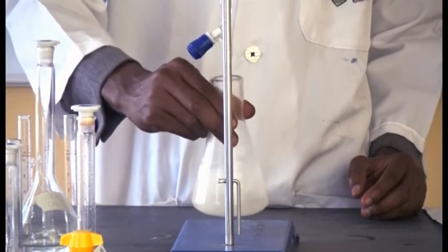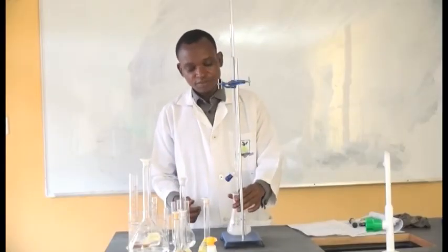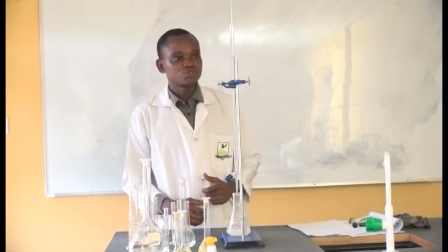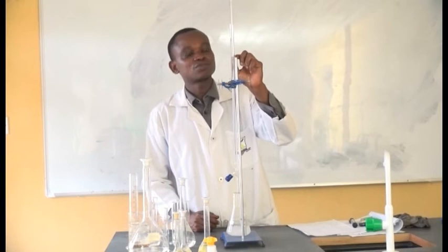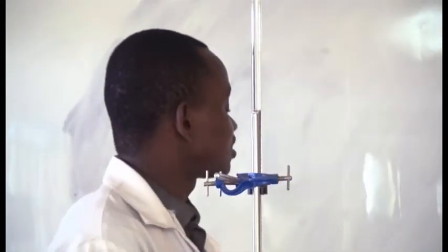Continue until you have a clear solution, then stop. At this point, the reaction has taken place. Note your titer value — go to your burette and take the reading. The titer value is 16 cm³.